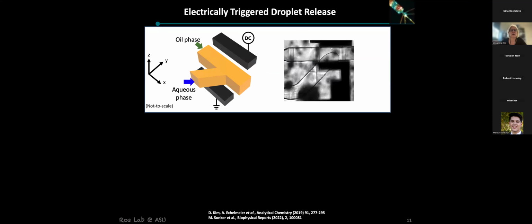Here again is the schematic showing the fluidic channels in yellow, and then the electrodes very close by. We use 3D printing again to achieve this assembly and use a trick here. We print empty channels in very close proximity to the fluidic channels, and then fill these channels with conductive material so that we can bring these electrodes very close to the droplet generation region. The video shows how the droplets are generated. This is without a stimulation. But then when we stimulate, what happens is the following.